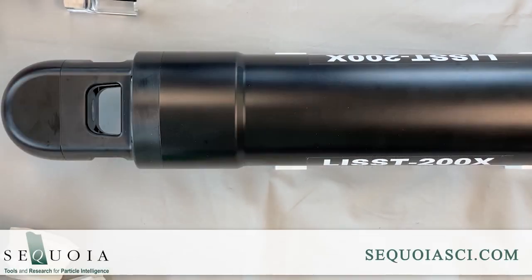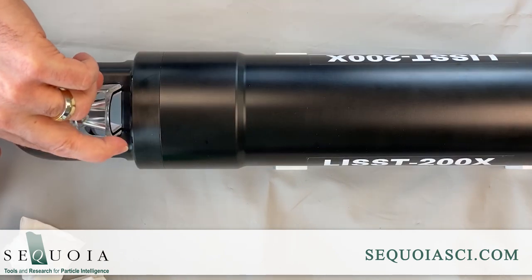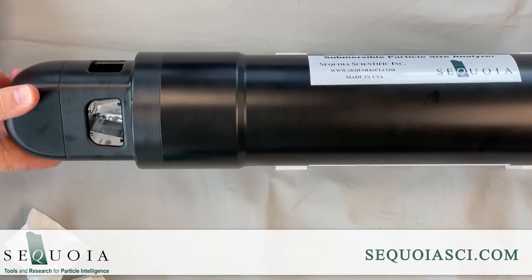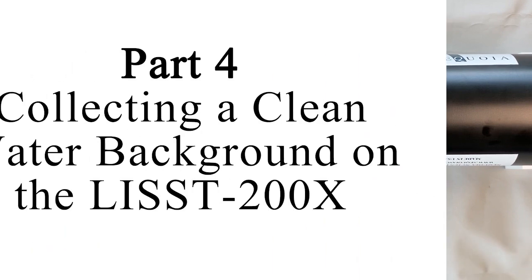The next step is to obtain a clean water background to make sure the windows are clean and that we have a record of measurement of the light scattering from clean water that will be used for the processing of the field data. The easiest way to obtain a clean water background is to install the small volume test chamber onto the optics end of the LISST-200X. This small chamber seals on the sides of the opening around the windows. The small volume test chamber has O-rings on the sides and simply slides into the larger opening on the side of the LISST-200X optics end. Slide the chamber into the opening until it is fully inserted, forming a cavity that can be filled with clean filtered water.